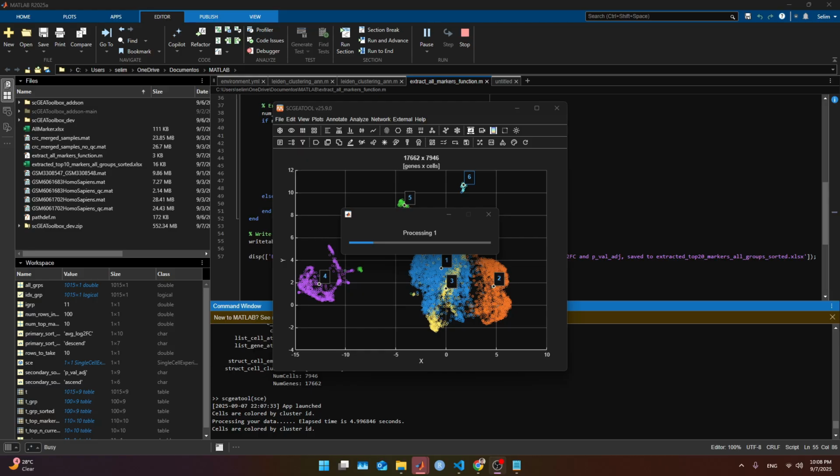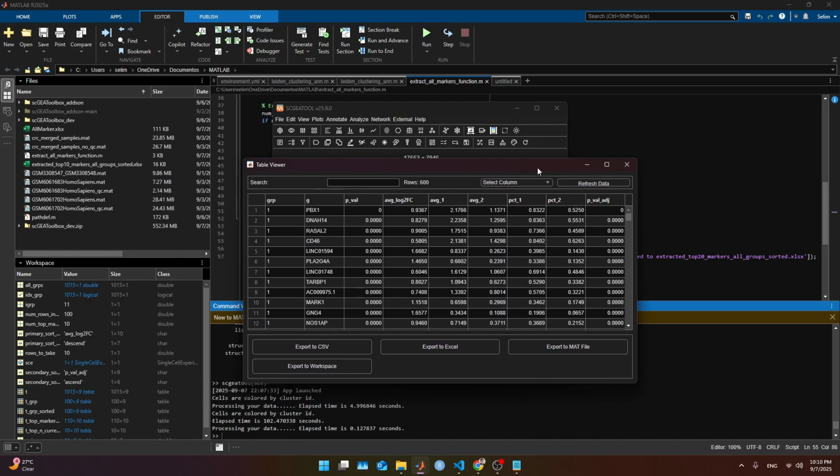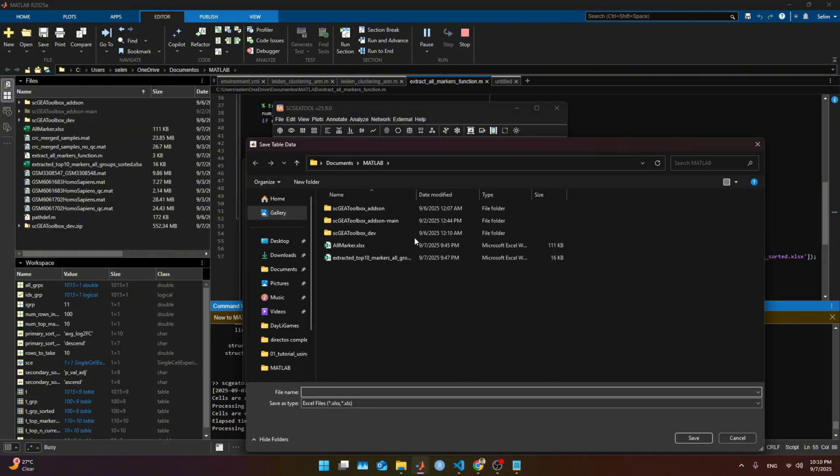I'm gonna stop it and come back in a few minutes. Okie dokie. Sorry for taking that much time. I know the video is already too lengthy, but it's as difficult as this, doing the annotation. Again, we're gonna export, and I'm gonna override the all markers.